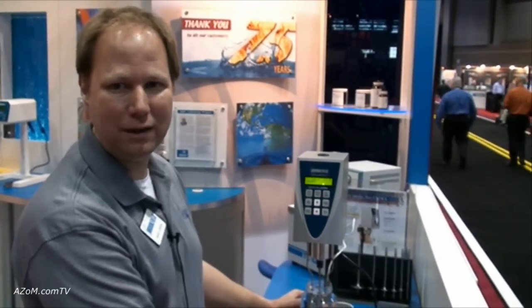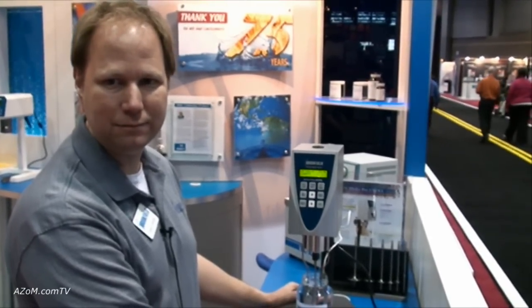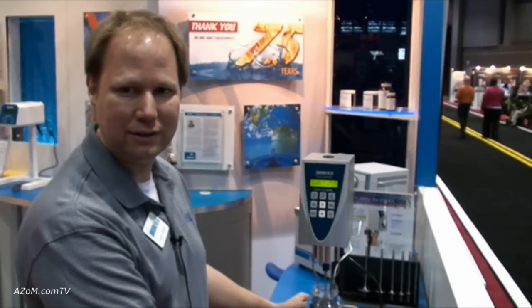Is this your most popular model? This is our most popular model. We have many models, but this is the newest version of our most popular one. And when did you release this one? This year, 2009.